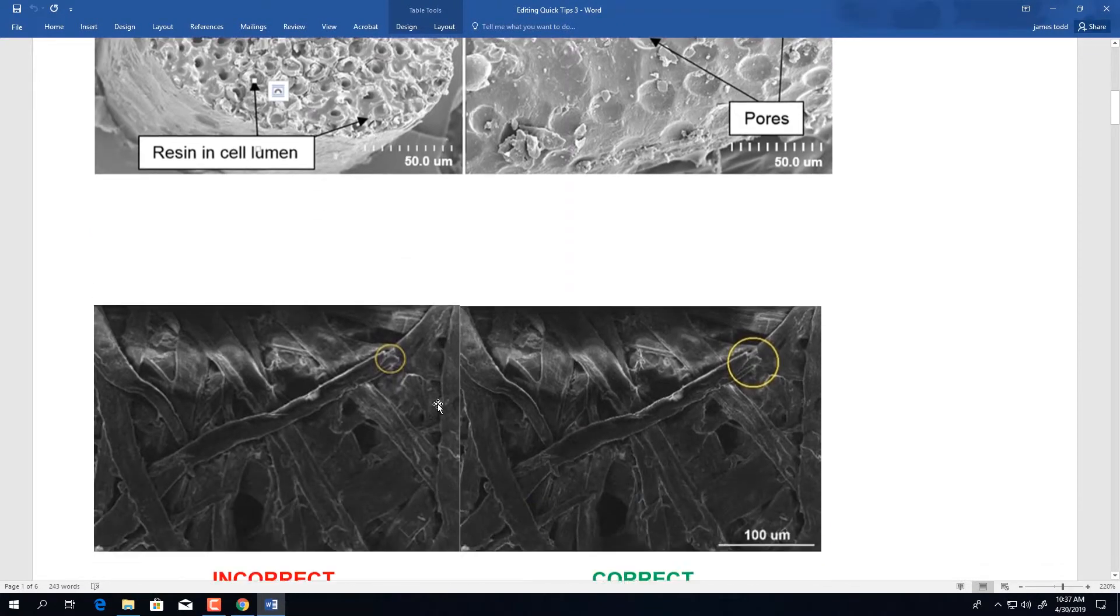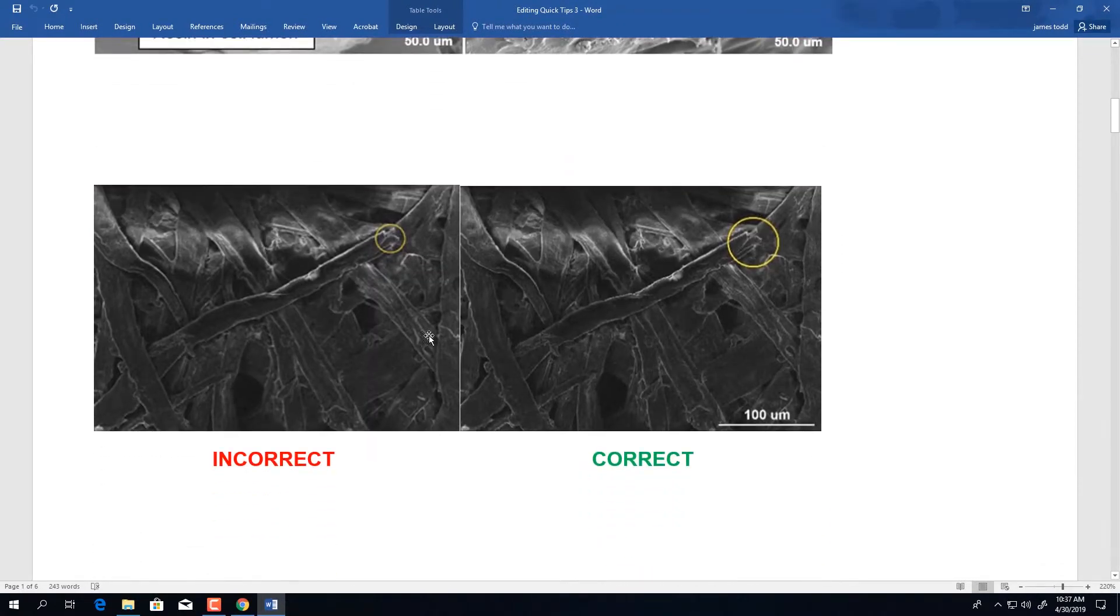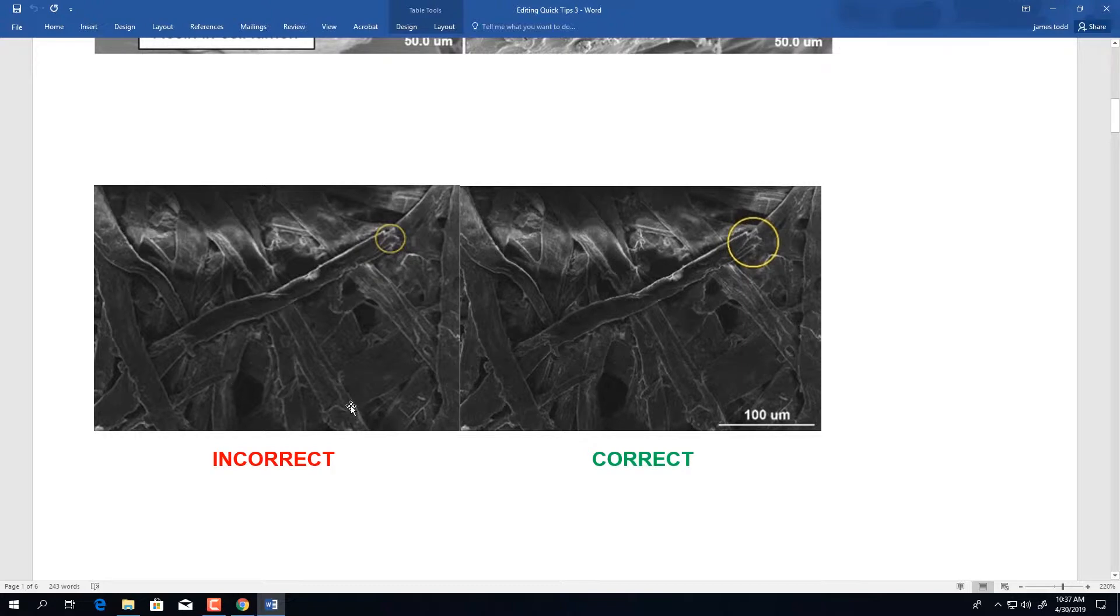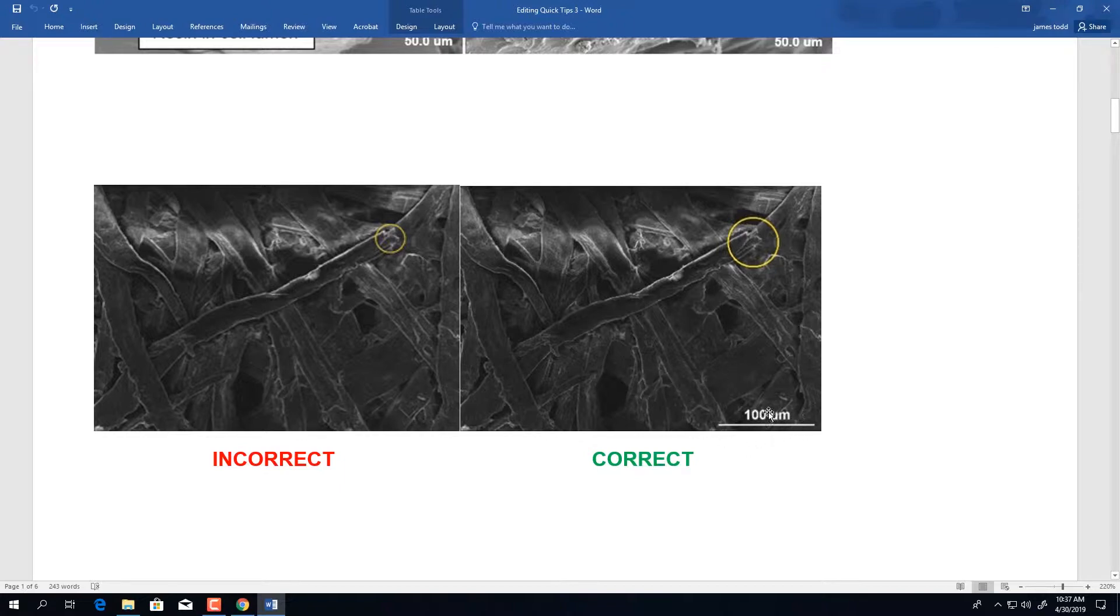Looking at the next example, this was an image submitted to us that was missing a scale bar. In the correct version, we have the appropriate size scale bar with the unit of measurement. Notice there is a space between the numerical value and the unit of measurement.